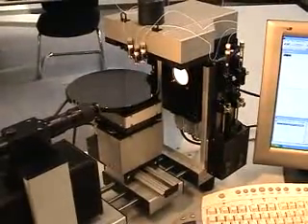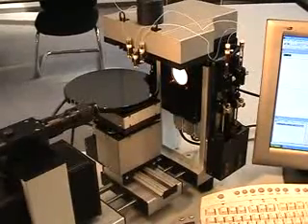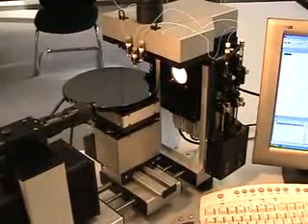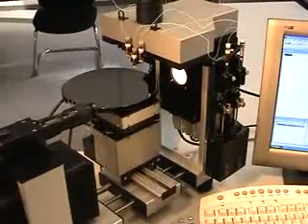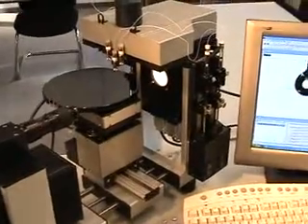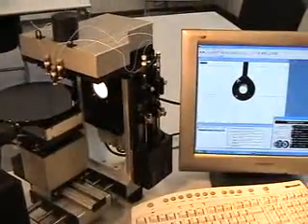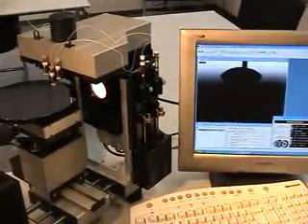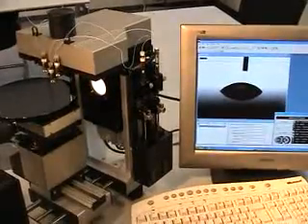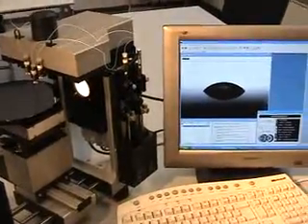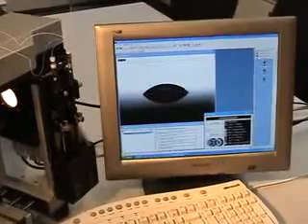Next measurement point is assigned now. Here we see the dosing. The droplet has been picked up and measurement is being done automatically.